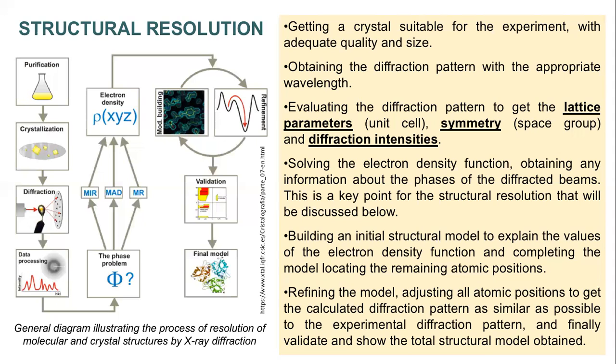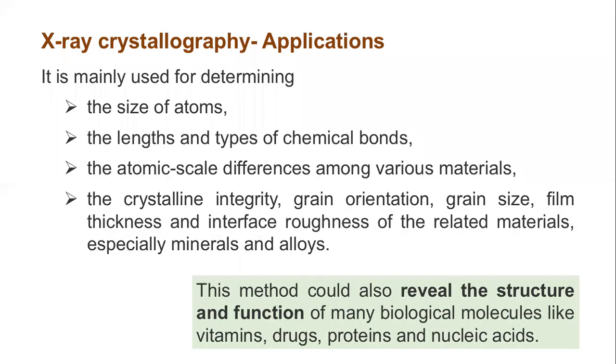So we need to have an understanding of the pattern to get the lattice parameters of the unit cells, the symmetry, as well as the diffraction intensities to understand the chemical nature, the bond nature, and how the molecules interact with each other.